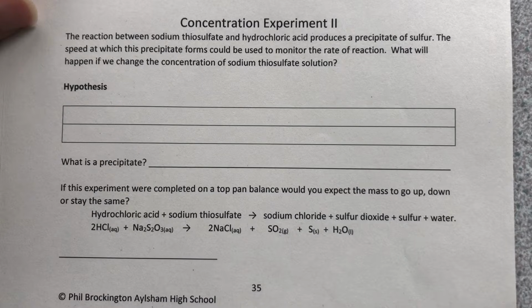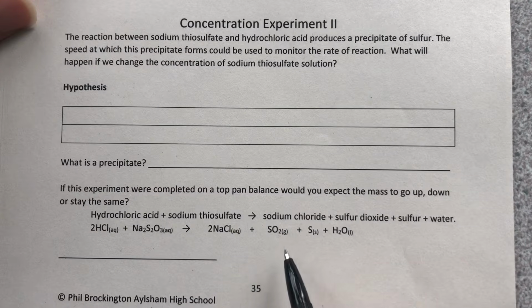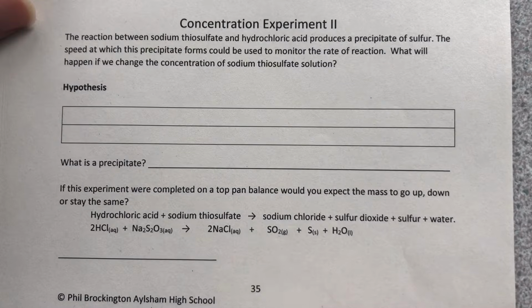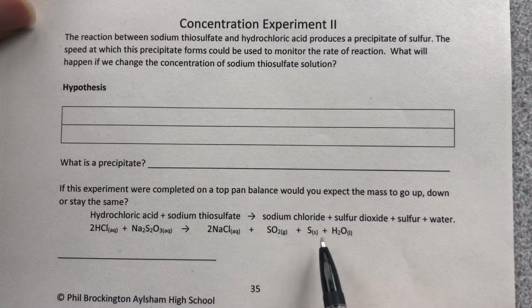Now you might be thinking, after the last rate of reaction core practical where we collected the volume of the gas given off, we could use the volume of sulfur dioxide gas produced, and I suppose we could do that. The reality is this produces very, very small amounts of products. We're doing this with very dilute reagents, so we're not going to see really a bubble, although you might expect it to. The way we're going to monitor the rate of this reaction is by looking at how quickly this sulfur solid is produced.